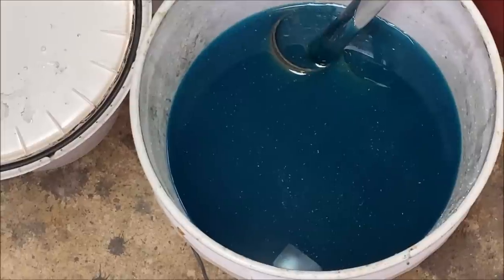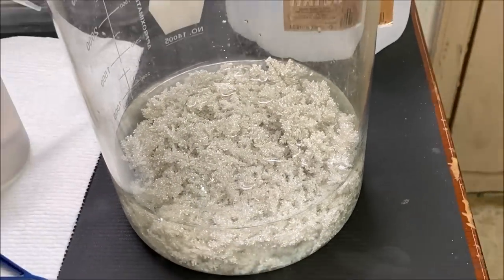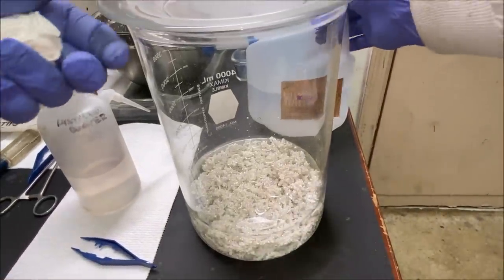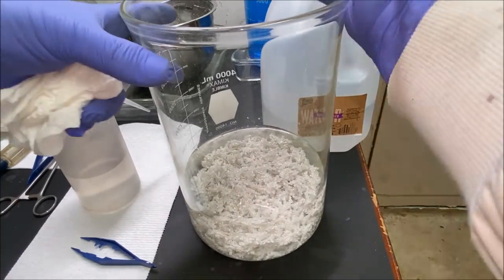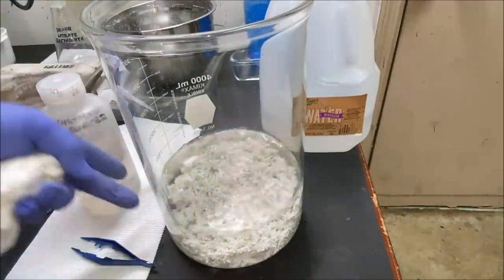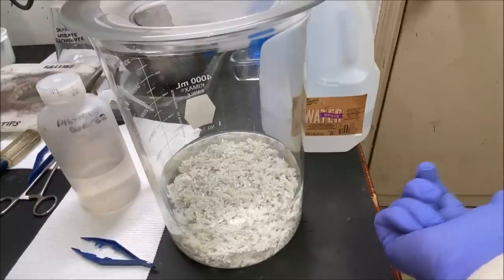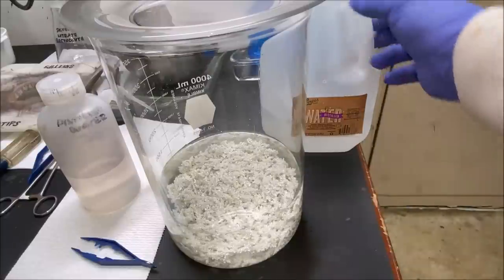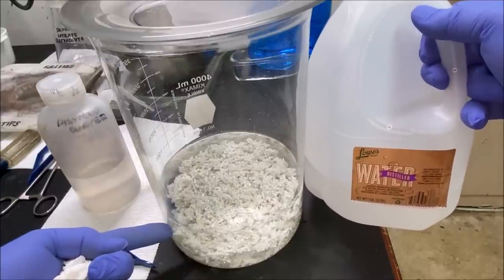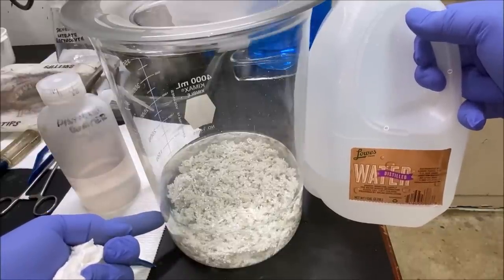I'm going to add more distilled water and keep rinsing this silver crystal over and over until I get all the electrolyte off of it, pouring it into my cementation bucket to cement out on those pieces of copper and recover any remaining silver. After I've got all the electrolyte rinsed off, I put it in a clean Corningware casserole dish and dry it bone dry. For now I'll submerge it in water and let it soak, adding more distilled water about six times until all the electrolyte is off — then we can dry it out and weigh it up.